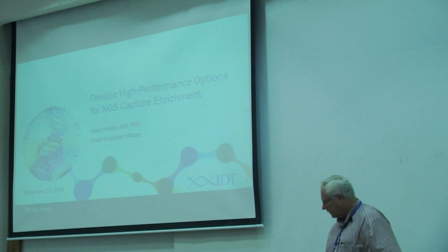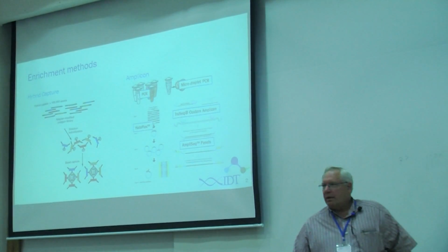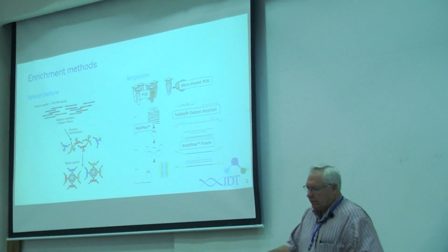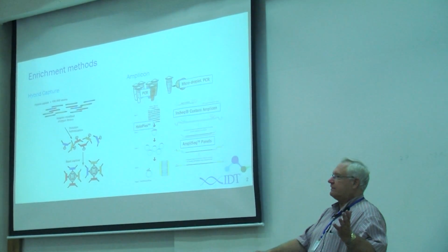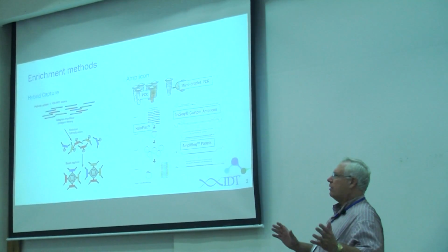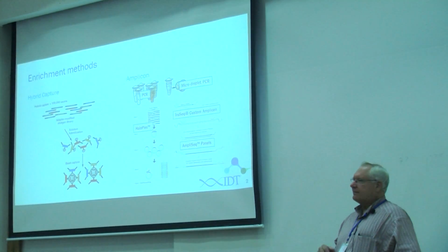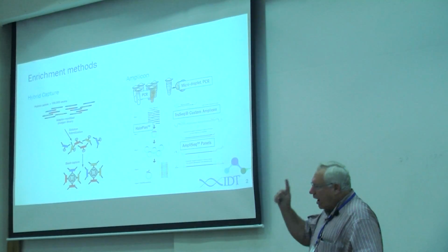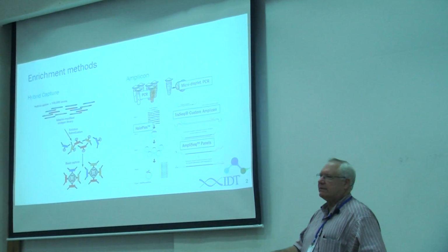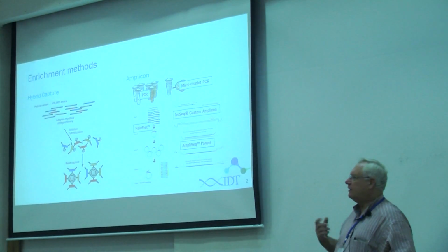But anyway, right now we want to talk about NGS capture methods. And so why do we care about this? Well, NGS has totally revolutionized sequencing. When I was a graduate student, I sequenced T cell receptors by Maxam-Gilbert, P32-based methods. In 3 years, it was a heroic effort, and I did 20,000 bases. As a postdoc, one gel of an AB373 did more sequencing than I did in 3 years as a grad student. So, enough to bring tears to your eyes.